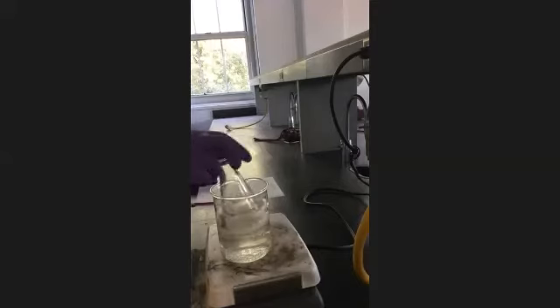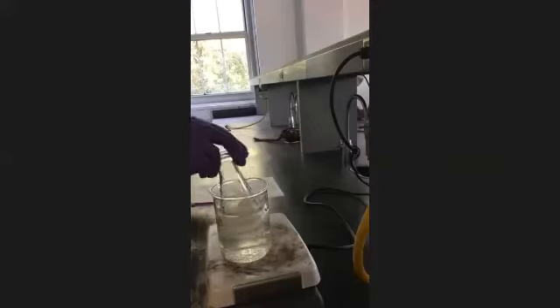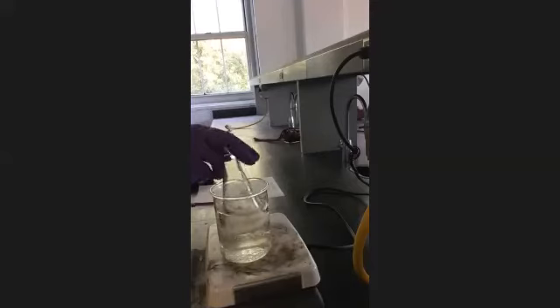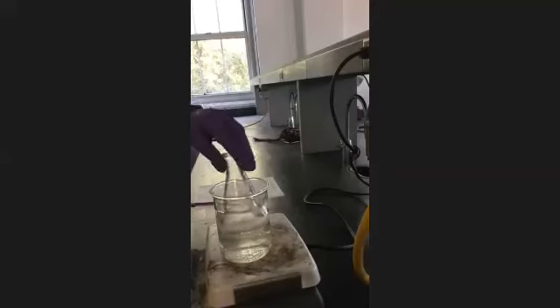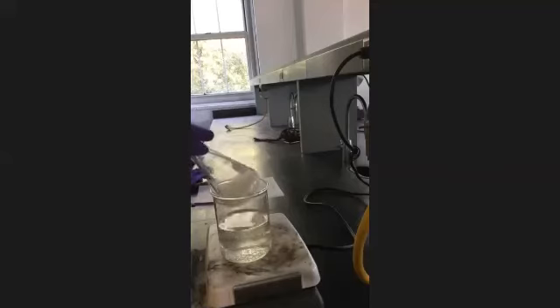You're gonna have to turn yours up some more. You see how it's going solid? Yeah, you gotta turn it up. I turned it up to 7. Should I turn it up more? No, that's fine. You just need to get that water to boil. That's the problem. It's not hot enough, and if the water is not hot enough, it won't go in solution.